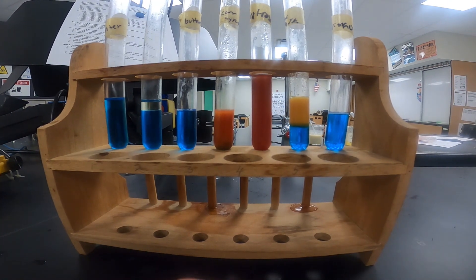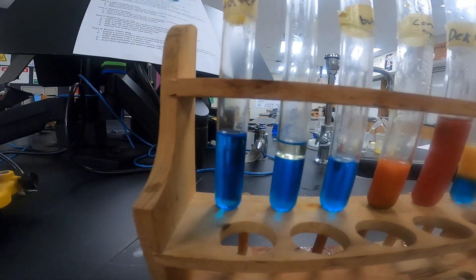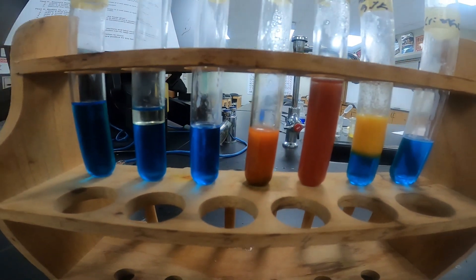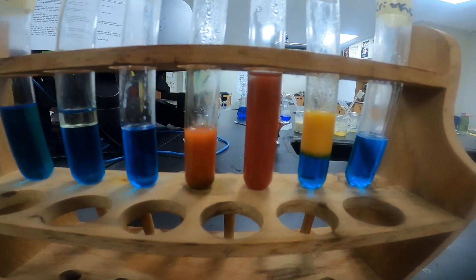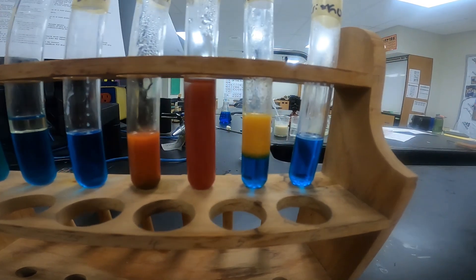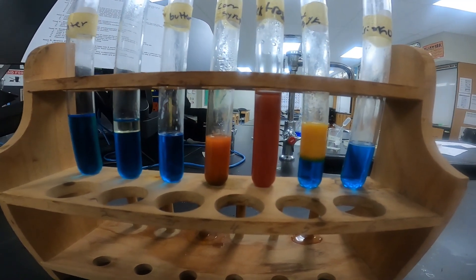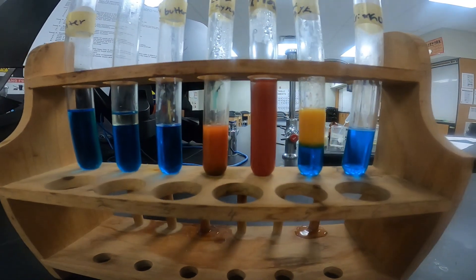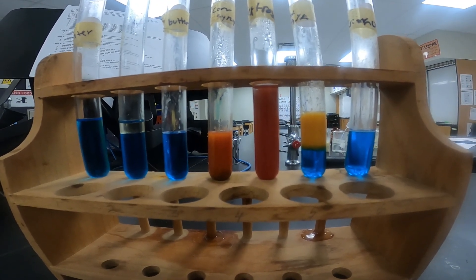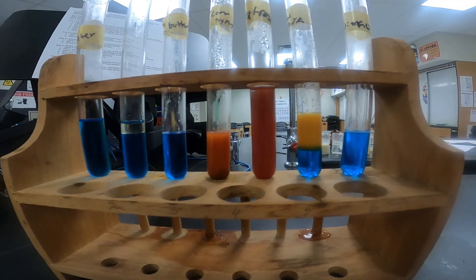Now that it's cooled down, we'll take our final look at our Benedict's test for simple sugars. Water is still blue, oil still blue, butter still blue. Corn syrup has a darker red appearance. Dextrose is a really dark red. Our oatmeal, after we mix it up, starts to be an orange-ish color. And then finally our Crisco stays blue. So if it stays blue, that shows there are no simple sugars present. A change to an orange, red, or green color indicates the presence of simple sugars — the darker that color, the more sugar is present.